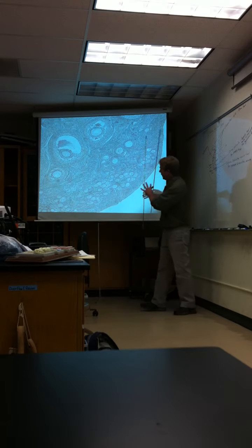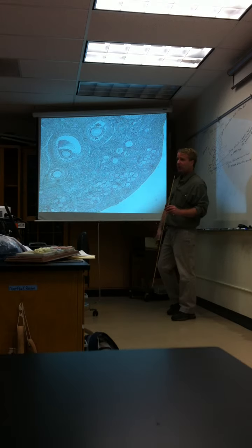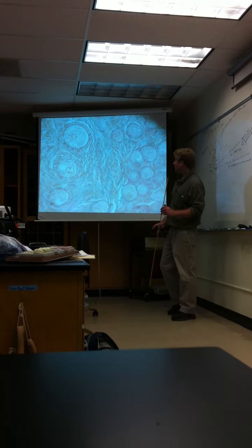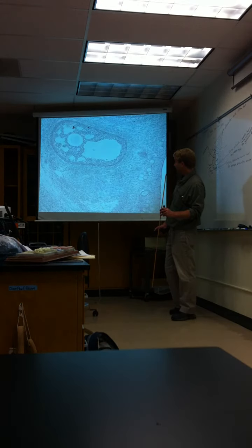And so if you have this slide, you should be able to find pretty good examples of things, but it's a little more difficult. And so on D2L, there are plenty of different examples. And so you can go through the D2L pictures and see if you can identify the different follicles.